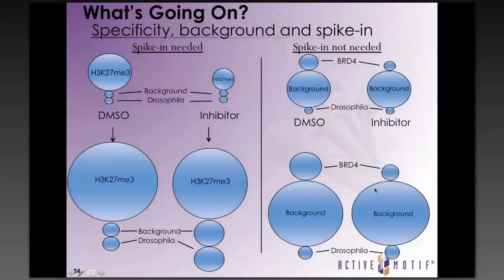I think the first thing is to note that there are differences depending on what antibody you use. When we do ChIP-Seq in the presence of a BRD4 inhibitor, we can clearly see the reduced signal in the presence of the inhibitor. So we don't know how globally this is going to be applied to different transcription factors or antibodies, but we do know that it's necessary when there's global changes for K27-trimethyl, and we seem to shift our data as expected with the K27 acetyl antibody as well.